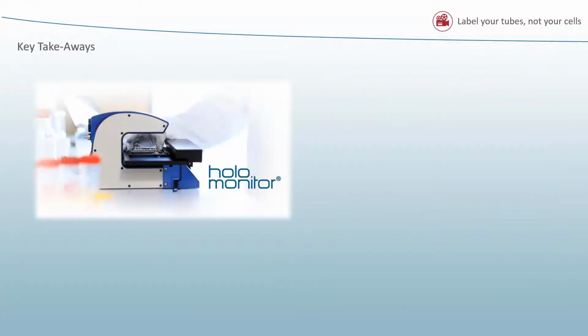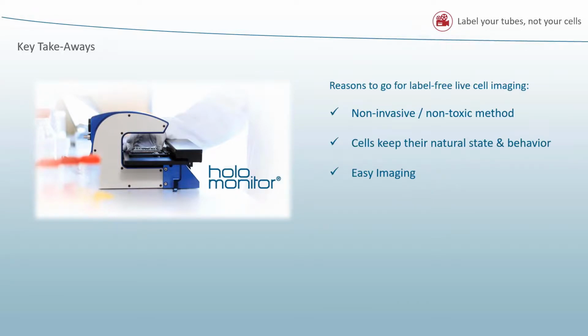Yeah, that brings me already to the final slide, guys, with the take-home messages, which are the reasons why you should go label-free. Label-free is cell-friendly. It's a non-invasive method. And cells are able, therefore, to keep their natural state and behavior for you to get more trustworthy data.